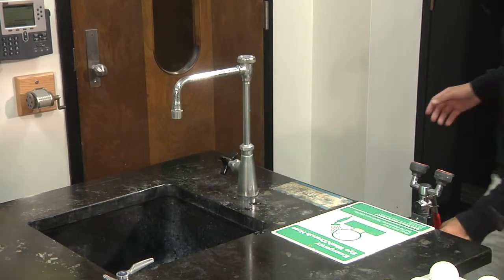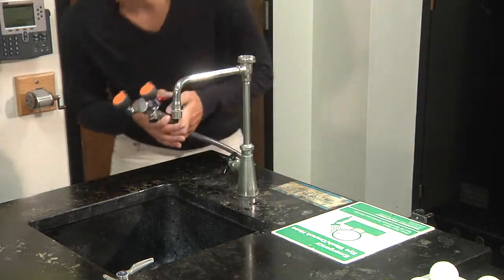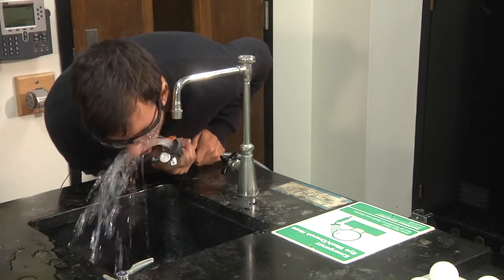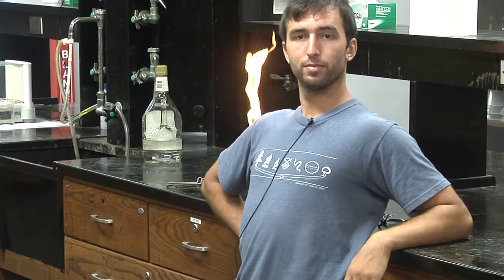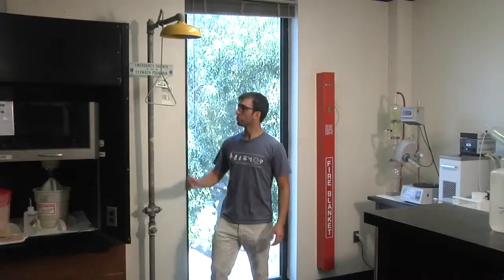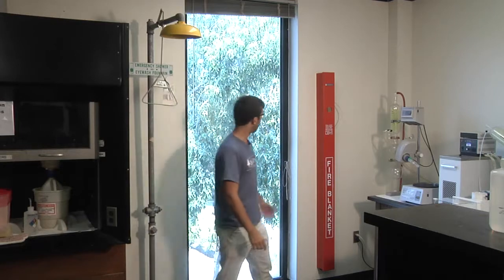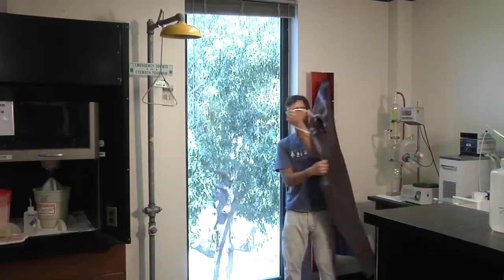The eyewash station is located at the front of the lab. To operate, just pull out, point at your eyes, and squeeze. Don't forget to remove your safety glasses. If you happen to be on fire, you can use the safety shower by standing under it and pulling this handle, or the fire blanket by merely pulling this and wrapping it around your body.